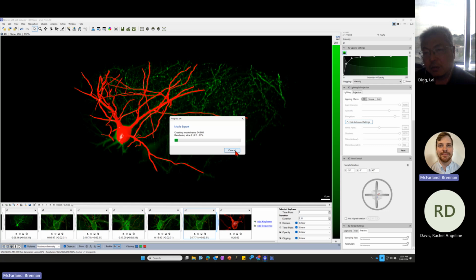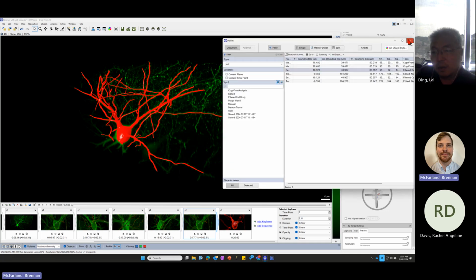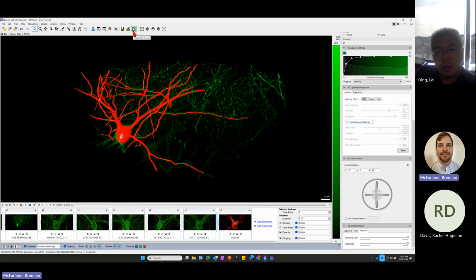So I'm going to stop this just because it takes a little bit of time. But I can also just generate this movie and then send it to you afterwards, just so you can see what it looks like. But that's not what I want.